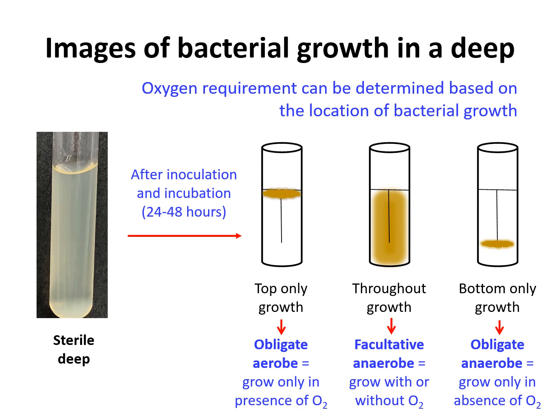If you shake it, you're going to mess up the pattern, and so your data is all going to be messed up. So make sure that after you incubate your deep, you handle it very carefully and do not shake those tubes.